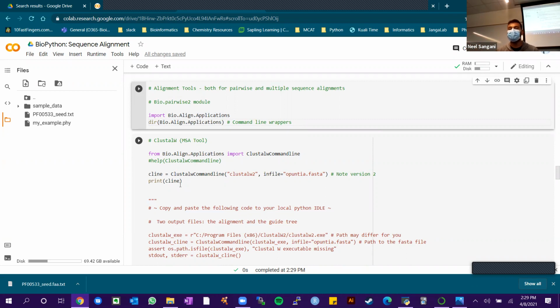We simply have to give our files and the parameters that we want, what gaps we want to give, what score and penalty, all those kinds of stats. So we just have to give simple numbers, and then it takes all that information, puts it in the code in the background, and pulls the alignment, standard error, etc., and then it gives out an output file, and we'll look at how that is generated here.